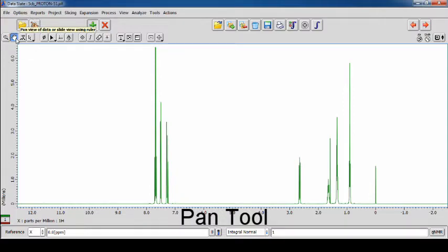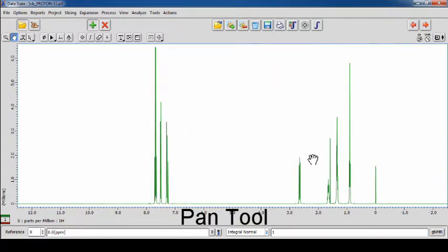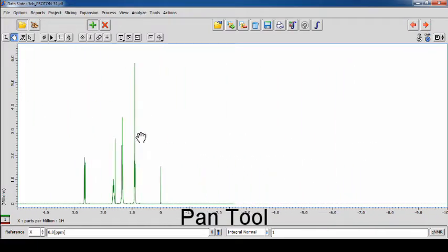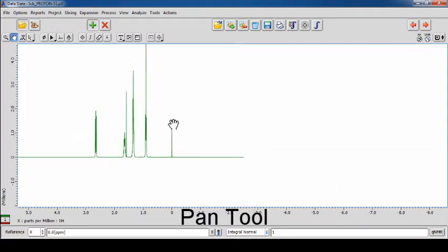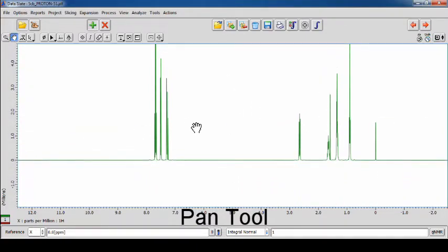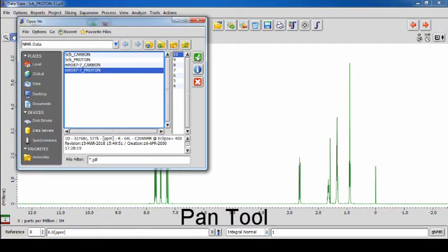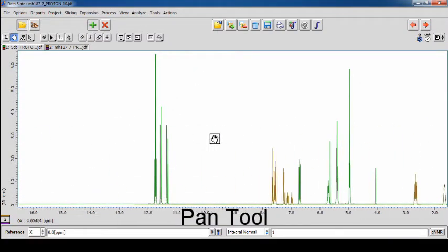The pan tool is used to pan the data layer, limited to the center point of the data. The Shift key will lock the pan to the X or the Y axis until either the Shift key or the left mouse button are released. Holding Alt allows the panning of separate data layers. Pressing the R key or Home will recenter the data.